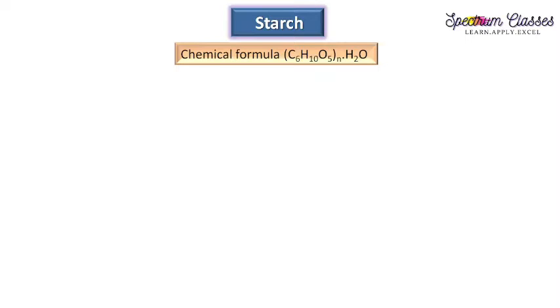This is my lab activity video, and in this video I am going to tell you how to prepare the starch solution which is used as an indicator. Apart from being used as an indicator, it is also a colloidal solution. I am not going to discuss the colloidal solution in this video. I am going to discuss its application as a starch indicator.